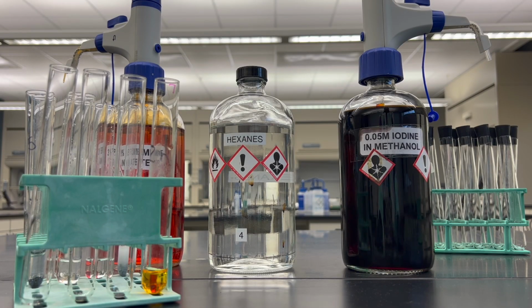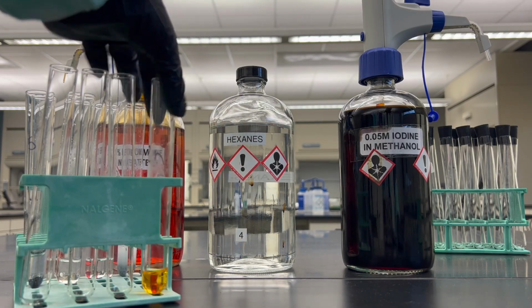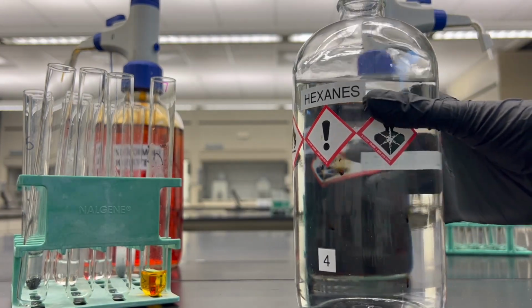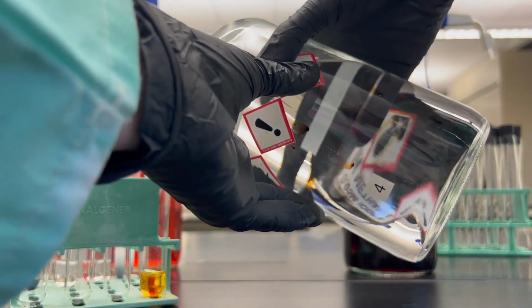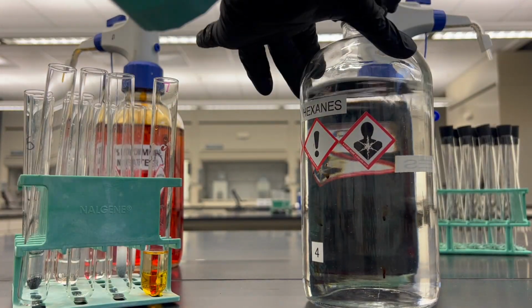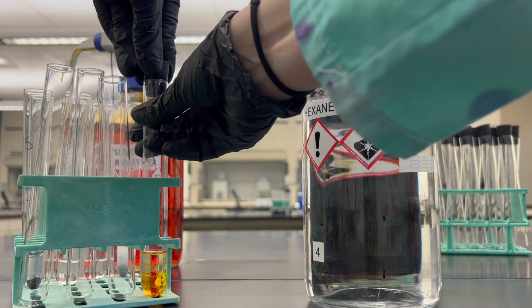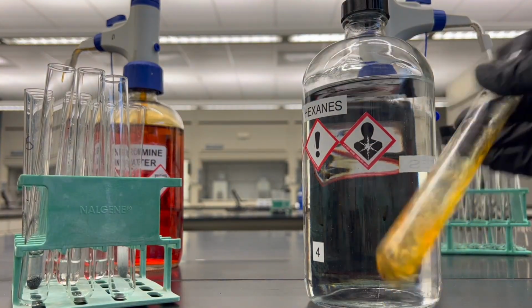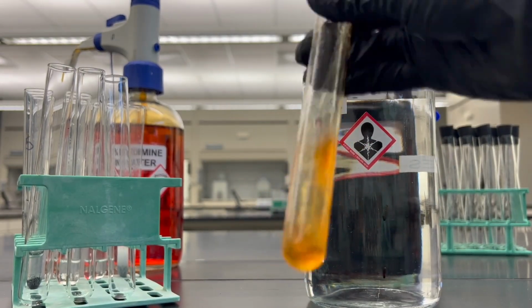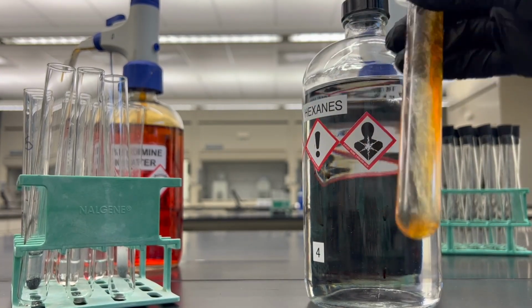Okay, so now we're going to start reacting with some nonmetals. So I have in my first test tube here some bromine and water. So that's Br2, elemental bromine, and I'm going to mix it with some hexanes. I'm going to cap it nice and tight. I'm going to shake it vigorously. This is just so that all the bromine can react with and dissolve into the hexanes.